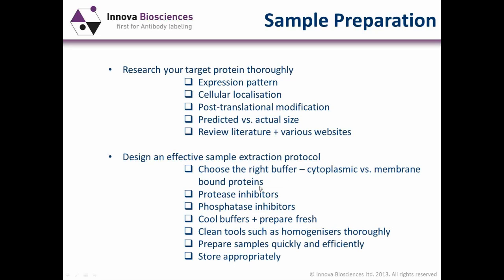It's pointless isolating the membrane fraction if you find that your protein's within the cytoplasm itself. And one thing to stop your protein being degraded very quickly is to add the necessary protease inhibitors such as PMSF. It's always important to make sure that these inhibitors are freshly prepared.